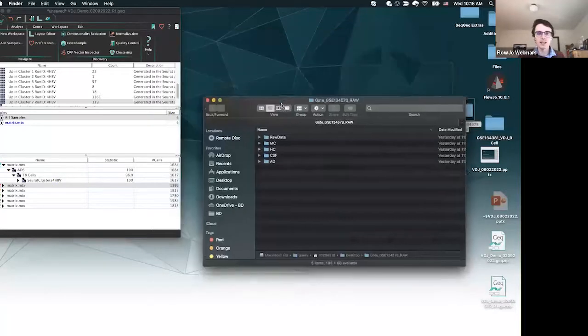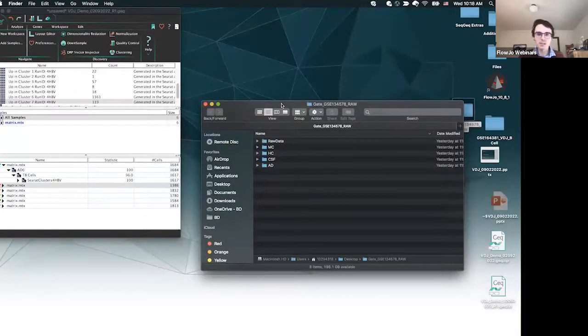And what this data is, it's from Stanford, it's from Gate et al. And what they were looking at was cerebral spinal fluid. So they're taking cerebral spinal fluid from 3 types of patients, from people with Alzheimer's disease, people with multiple sclerosis, and then some healthy controls. And I've labeled them AD for Alzheimer's disease, HC for healthy control, and MC for multiple sclerosis.